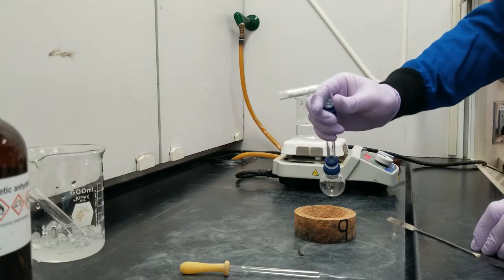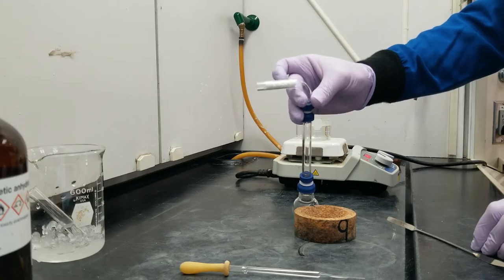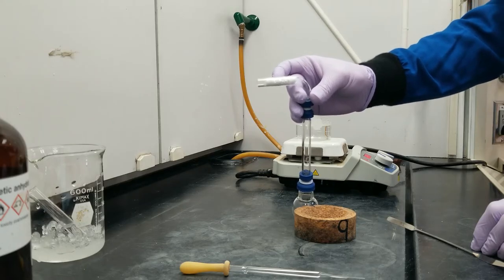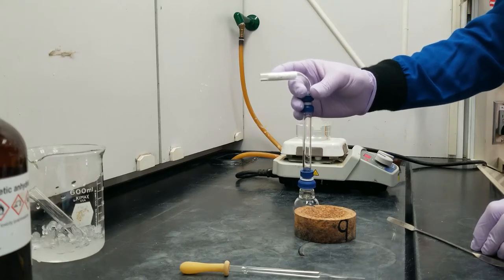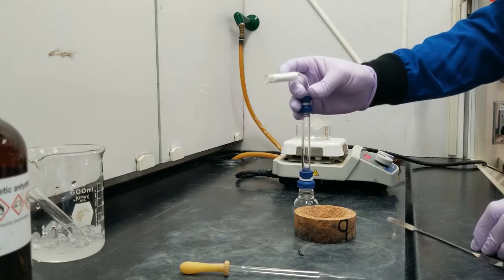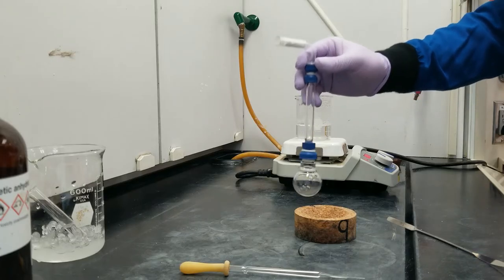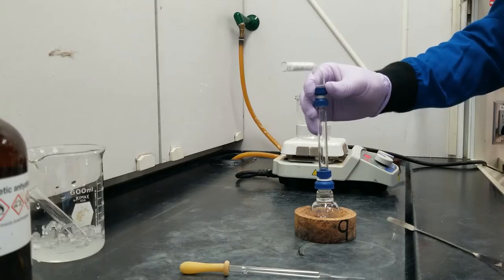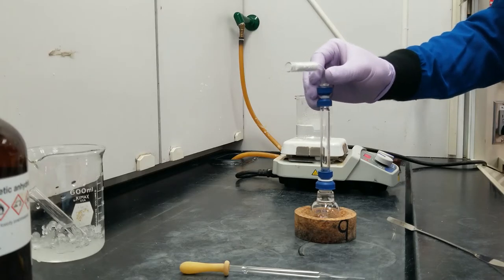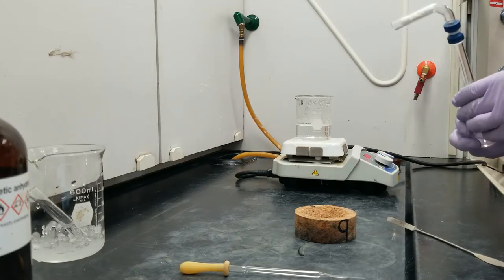This is just a bent piece of glass, and here I've got a cotton plug, and in the middle, this is calcium chloride. Now, calcium chloride is a desiccant, which means that it will react with water in the air and solidify it, so that removes it from the gases coming into the reaction. And so it's perfectly fine to do this over a steamy, hot water bath, and no water is going to spoil our reaction. Okay, with that said, let's start bringing in our reagents.